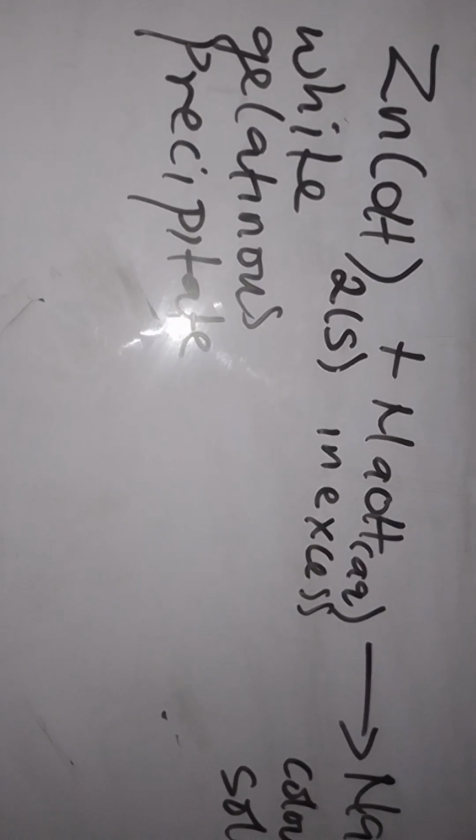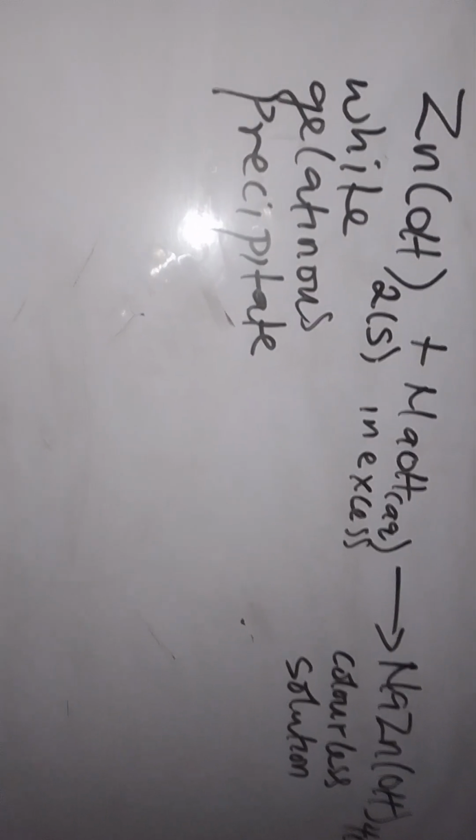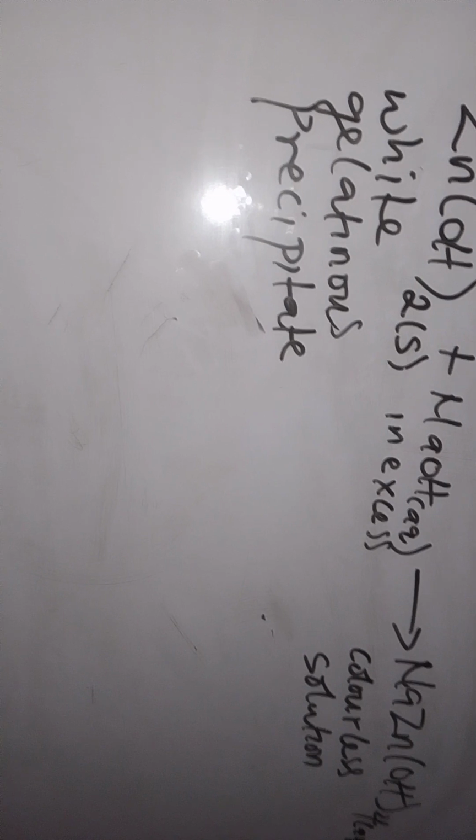So now let's go and see the practical of this. So before we go there, let us see how to test for zinc 2 ion using aqueous ammonia.